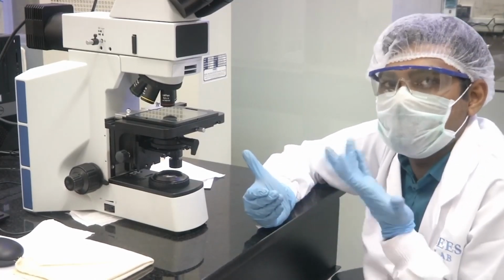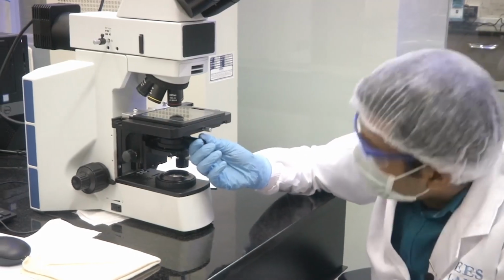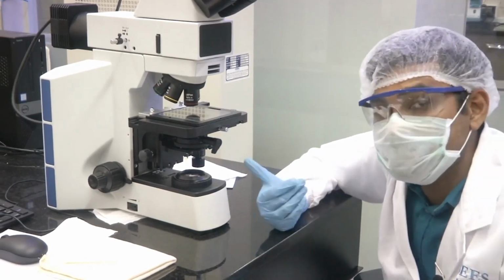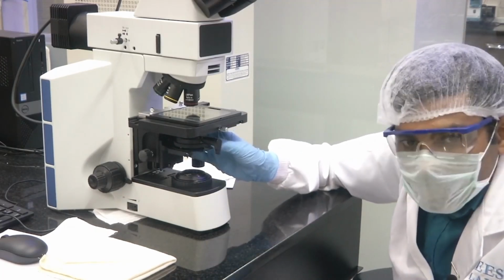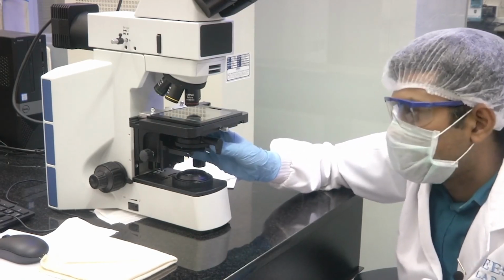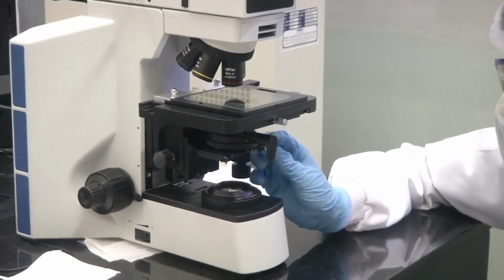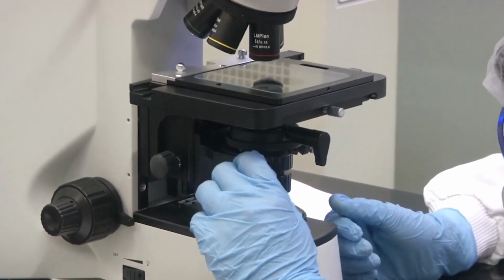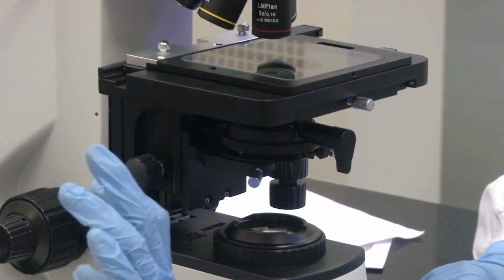optical light collecting mechanism. There is a knob here below with which you can adjust the aperture of your objective that collects the light. You can also adjust contrast through a phase ring that is provided below. So you can adjust the contrast and work with it. There are a lot of options provided on the microscope like this, and over time when you use it, you will get to know the exact utility of each of these options.